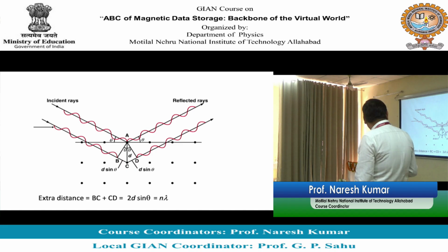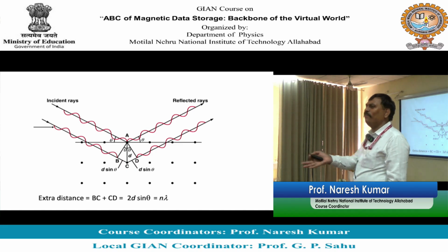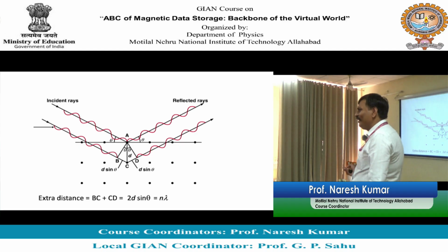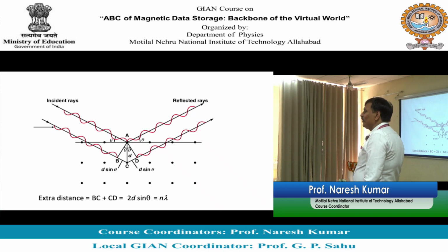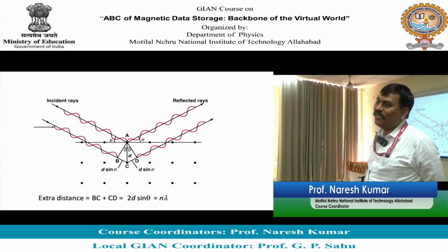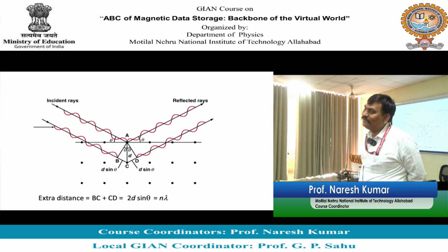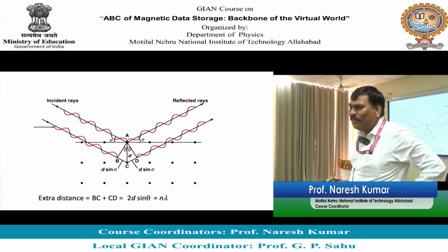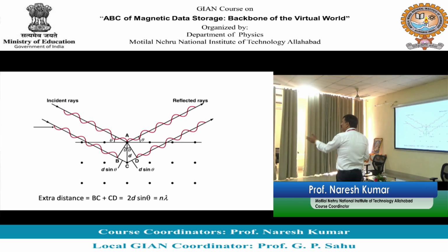अच्छा, एक और मैं आपको बता दूं, ये दो तीन सवाल हम लोग बहुत पूछते हैं, आप इंटरव्यू में जाएंगे मिल जाएगा. ये n क्या है? What is n? What do you mean by order? अभी देखो बड़ा अच्छा आंसर आएगा. n क्या होता है? ऑर्डर से मतलब क्या आपका सर? One, two, three, four ना, but what do you mean by it physically? What is the meaning of it?